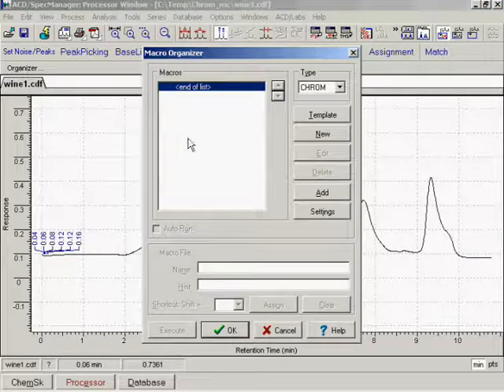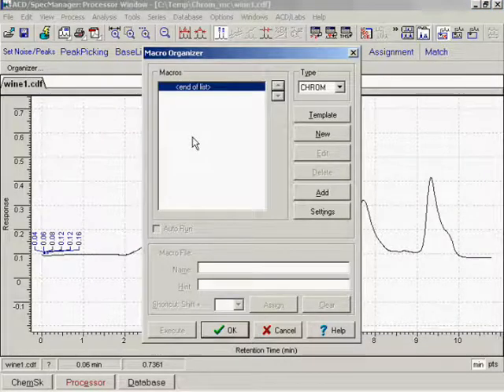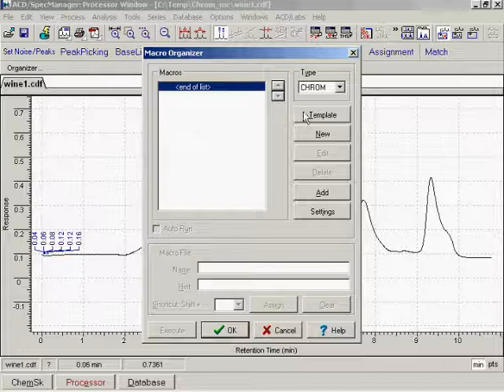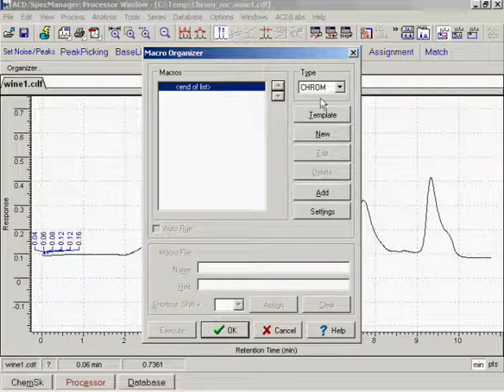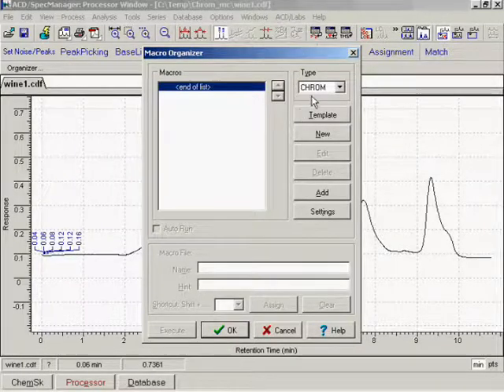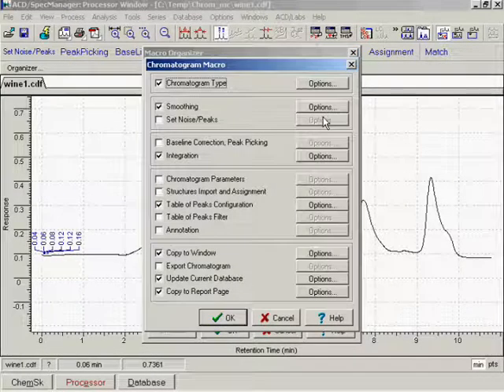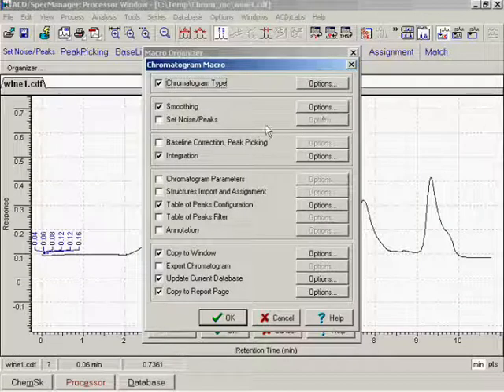Prior to creating a macro, specify its type. Use the macro template to make sure that the commands occur in the proper sequence.